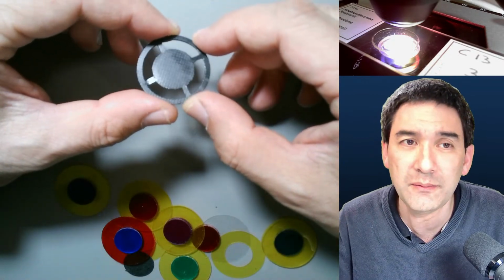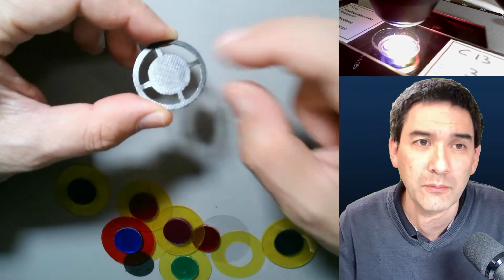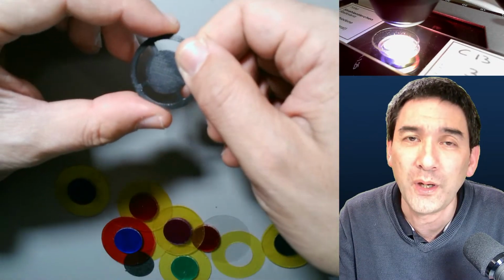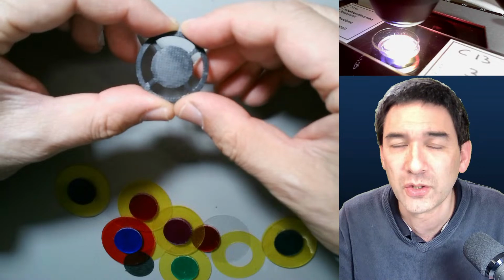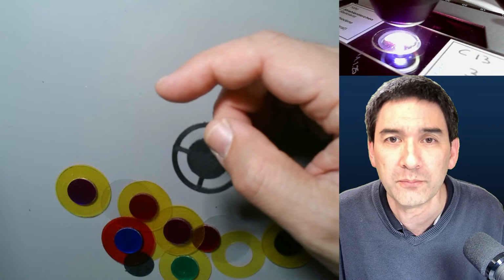I made, I don't know, 10, 15 of those filters, always changing the diameter a little bit until I found the one that actually worked well. So there has to be a minimum size, and experimentation is, I think, the best. Always make sure that the condenser is all the way on top.